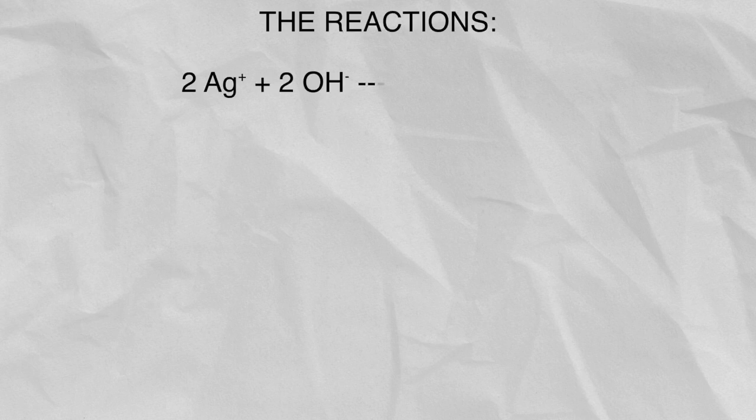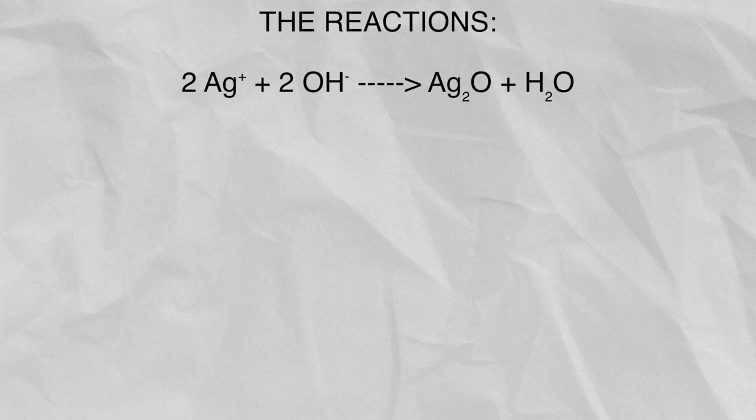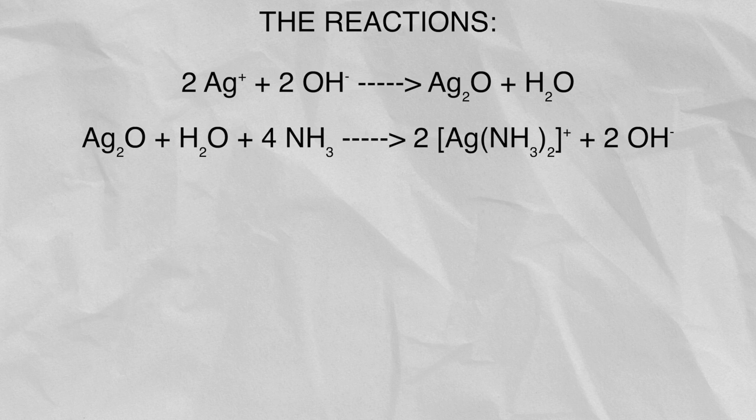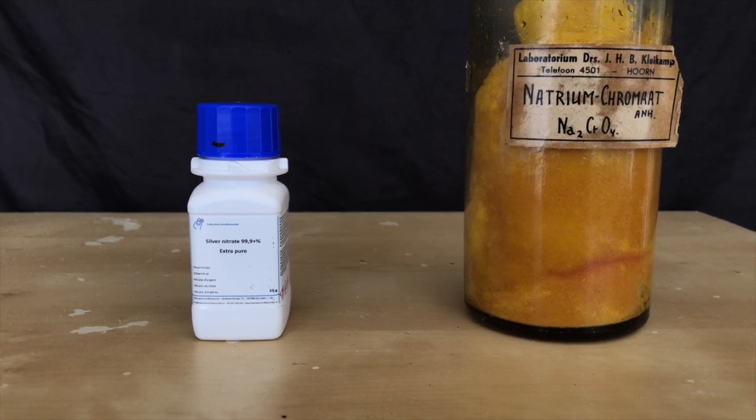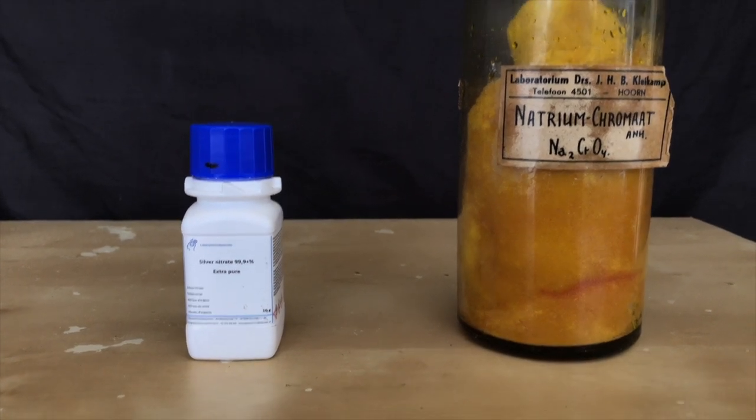At first, silver plus ions react with hydroxide ions to form insoluble silver oxide, which didn't happen in our case because I added way too much ammonia. The silver oxide then reacts with ammonia to form a water-soluble complex, which later on reacts with the glucose to form elemental silver. One of you had a great idea that I showed the test for silver using chromate.